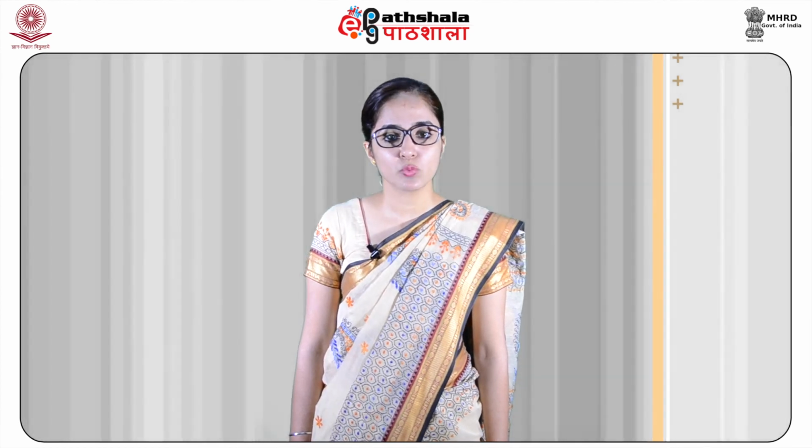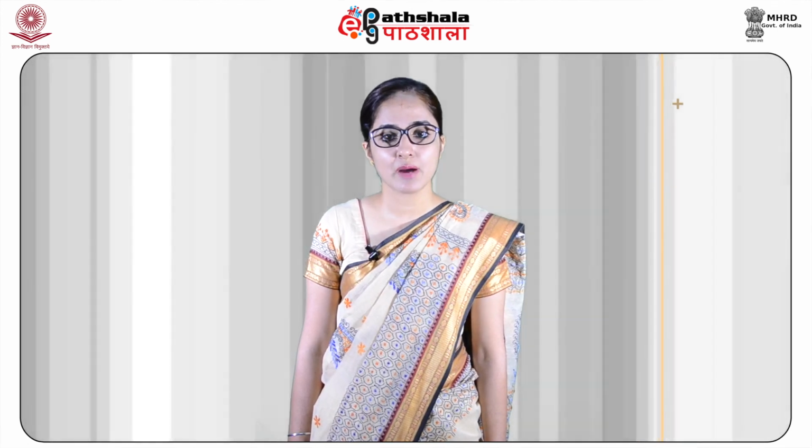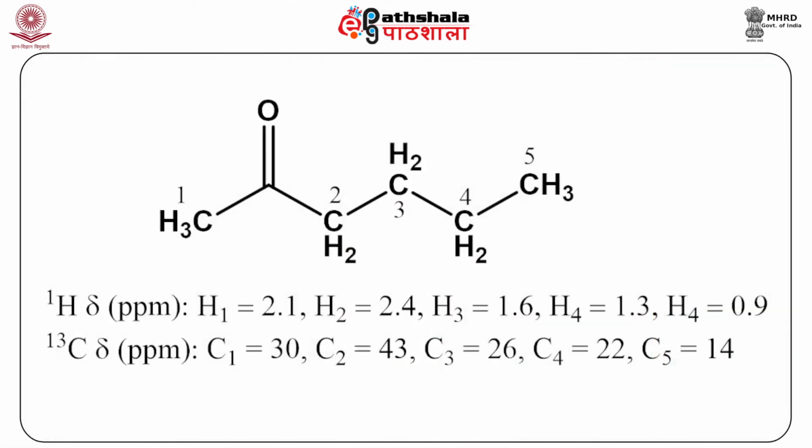By HETCOR spectrum, we can determine which hydrogen is attached to which carbon. There are no diagonal peaks in HETCOR and it is composed of only cross peaks, each relating to a carbon to its directly attached proton. Now let us look at the HETCOR spectrum of 2-hexanone again. In this we can see the difference between the COSY and the HETCOR of the same compound to explain the correlation between proton and carbon atoms.